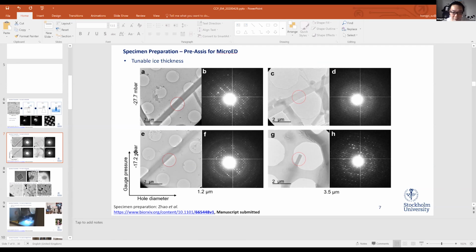But for the repositioning we are doing, when we defocus the reflection, we at least get an image of where the crystal is in relation to the beam. So during the next 10 frames, we know how to move the crystal back into the beam. It's like looking at snapshots of the movement and trying to compensate for it using the trackball. Before this was done, we were able to blindly track crystals with experience. But now with the images, I think it's much easier to track the crystal.